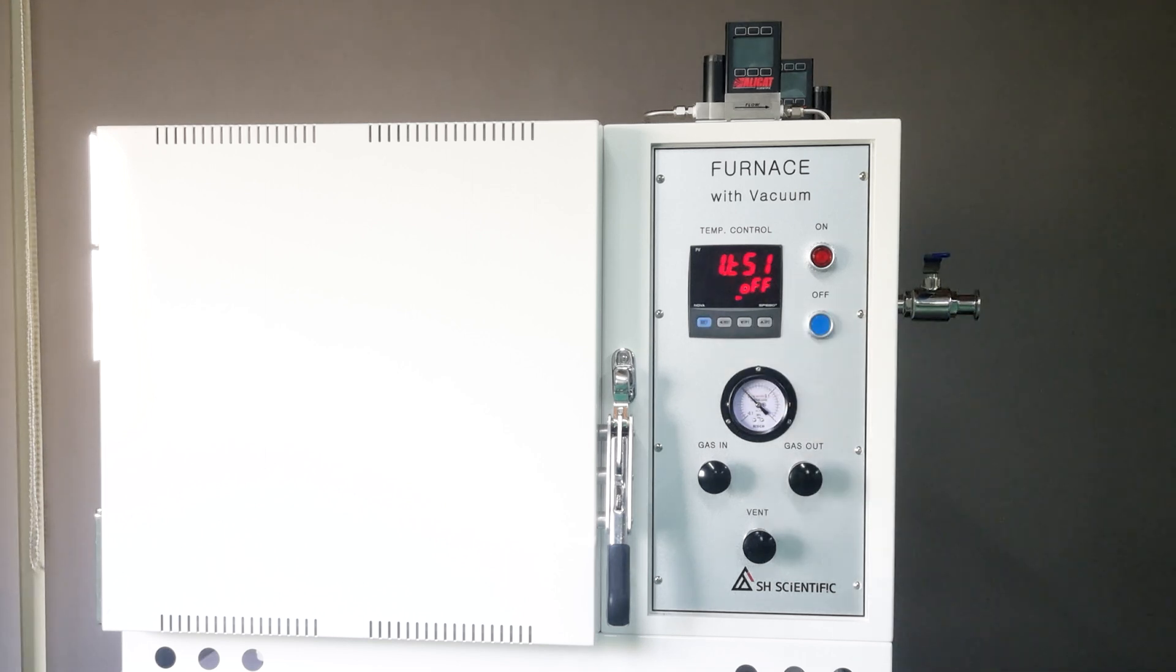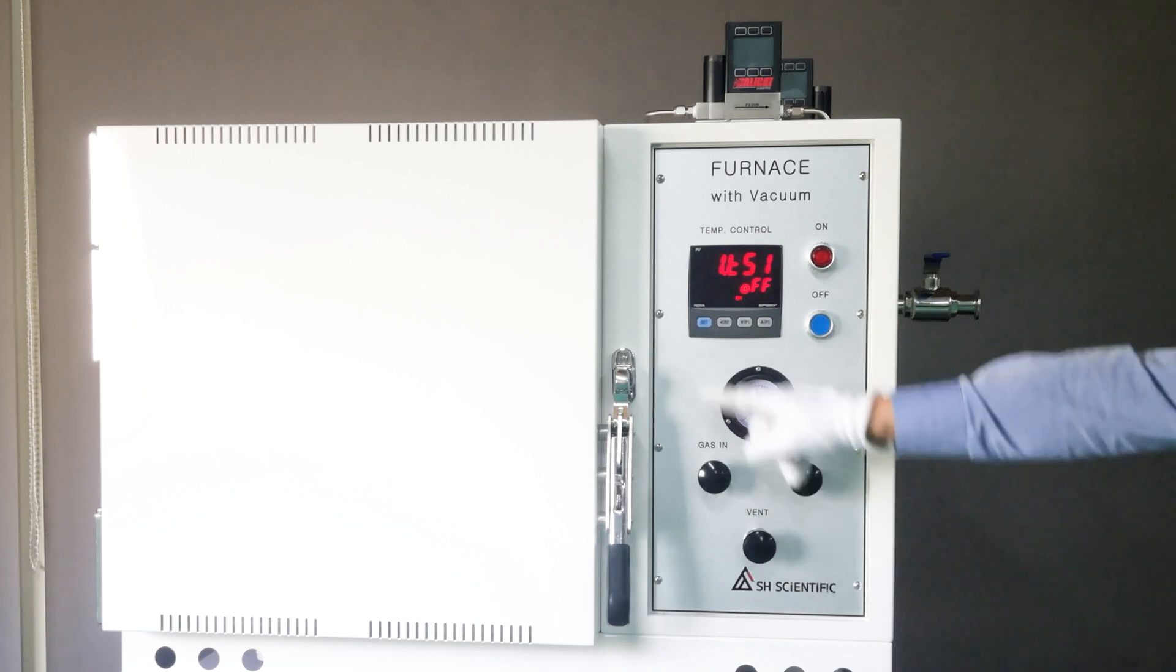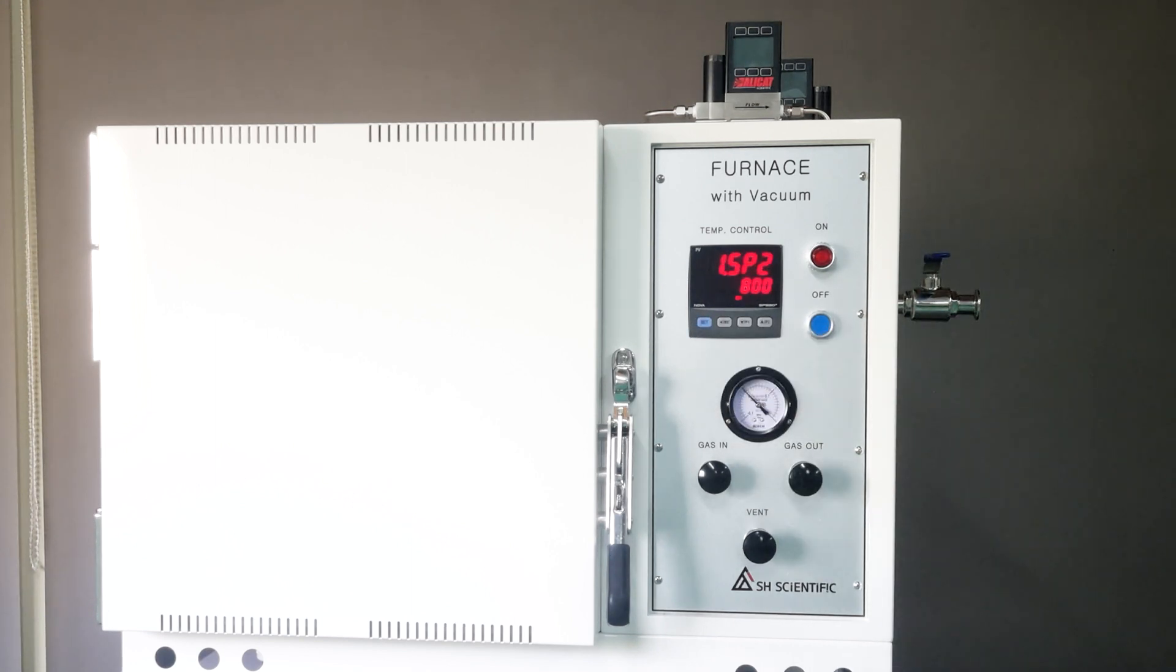Click set again to see 1TS1. Just keep it set to off, since we don't use this function. Click set again for 1SP2, which is the second temperature you want to reach or hold. I'm using 800 degrees Celsius again, which means 1SP2 is the same as 1SP1. So in effect, it will just hold 1SP1 straight through.